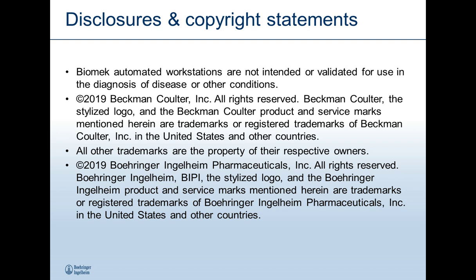But as far as the actual data processing and data visualization, the ones that we use are Prism and Spotfire, and I'm sure there's going to be a preference with that with most users.